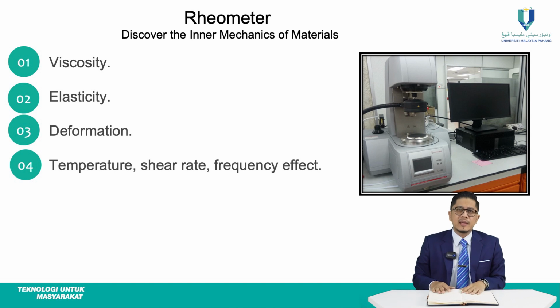By manipulating the testing conditions such as temperature, shear rate, and frequency, the rheometer can reveal valuable information on the material's processing, structure, and performance. Moreover, the rheometer can be used to characterize the mechanical properties of various materials, including gels, colloids, fluids, and soft matter.